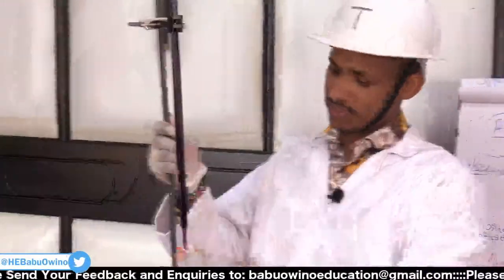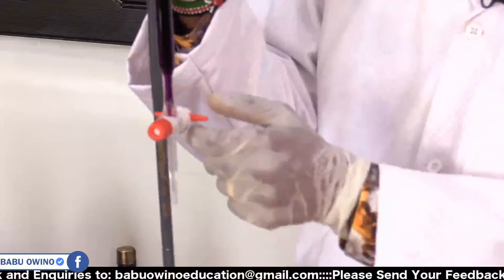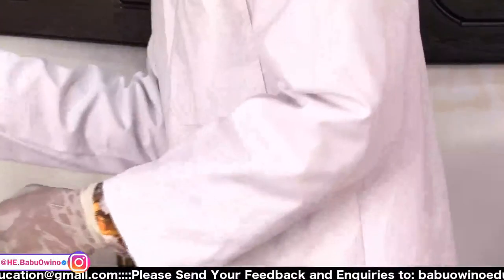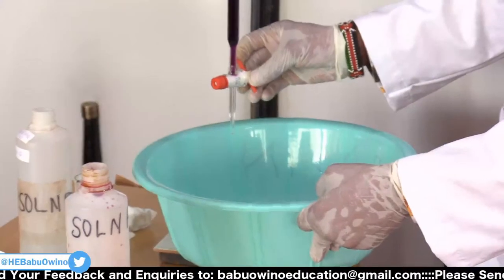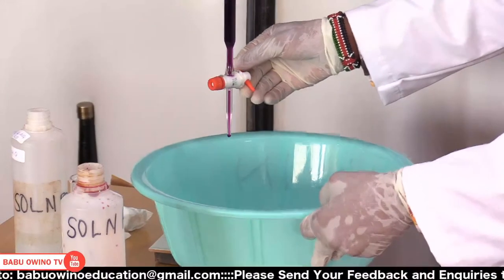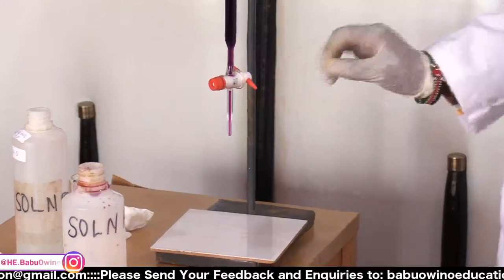Remind them. When you fill your burette, remember the lower part of the burette from the tap is not filled. So you release the tap so that the burette is completely full. Let me do it here. The other time we were using colorless fluids in the burette, but now we have a colored one. When you release a little bit, now it's full. So it's now full. Then you close it firmly, not so tight, just firmly.